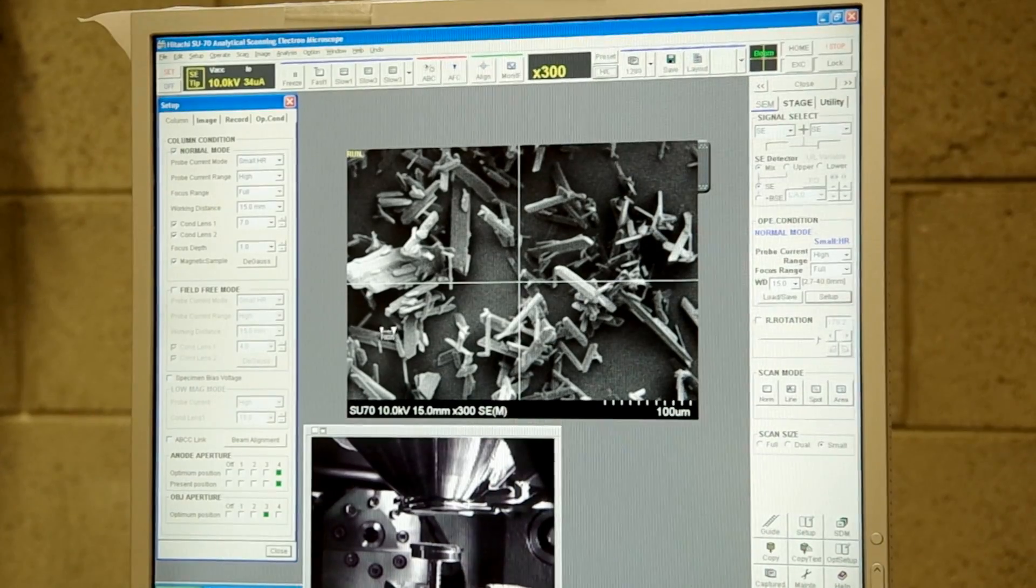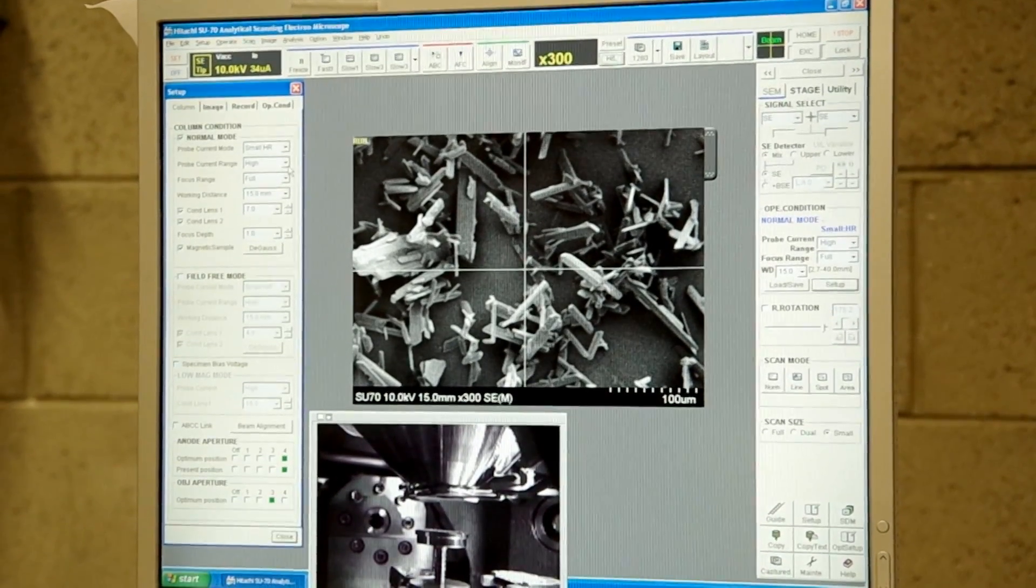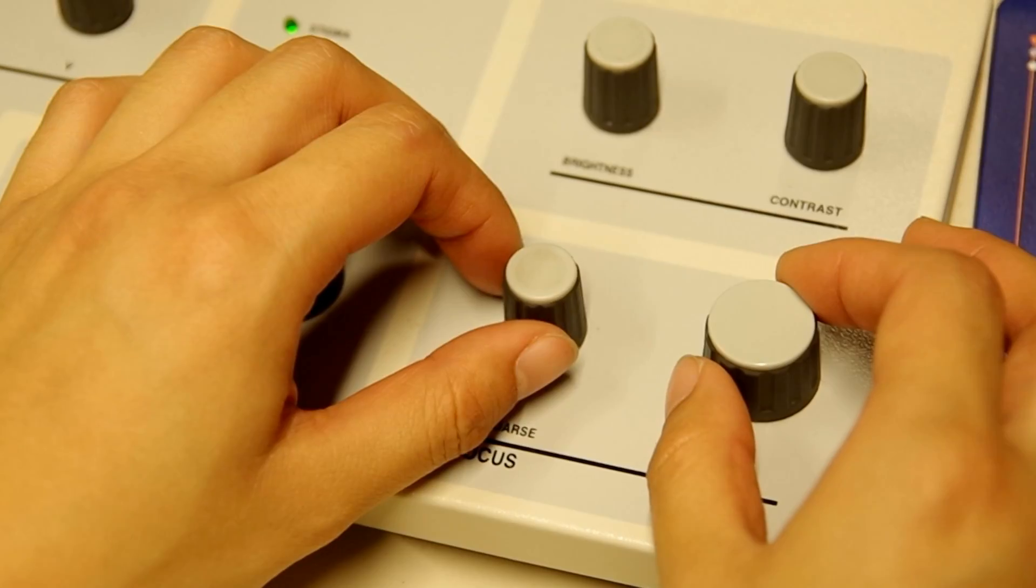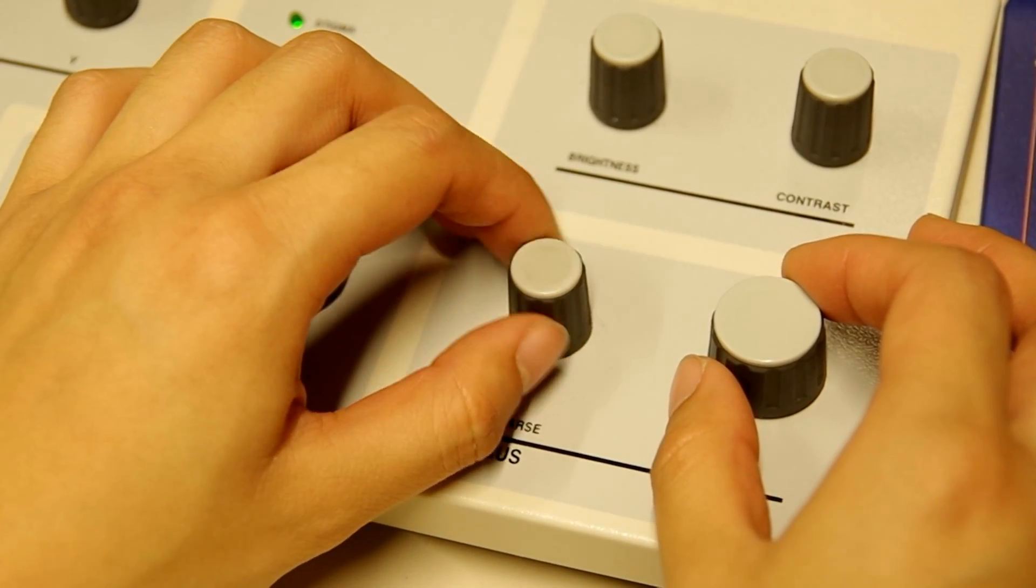The focus, brightness, magnification, and the point of interest is controlled by the control panel to get better images.